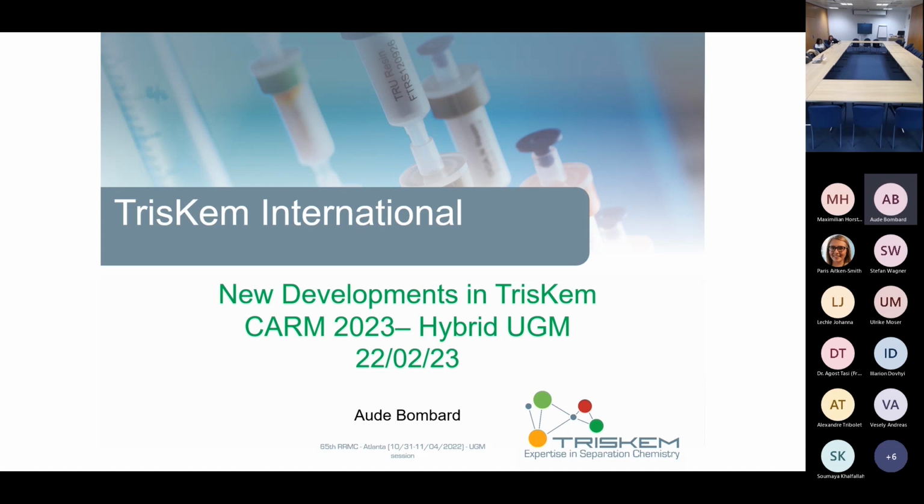On the new resins, there is the TK221 and the TK222. This one I will talk about, but the TK222 is also a new resin, mainly with an application in nuclear medicine, and for this reason it will be Stefan.